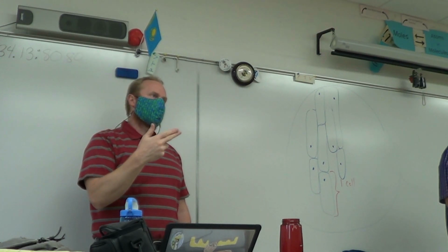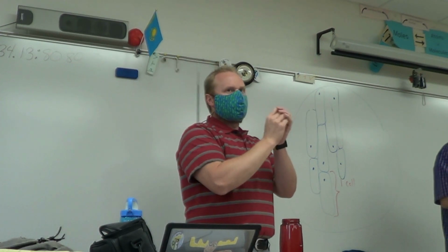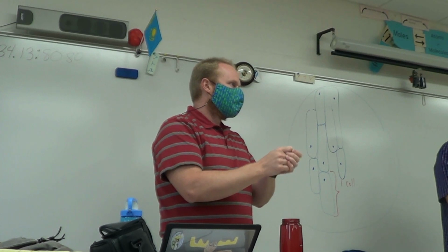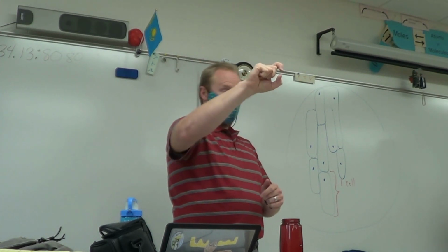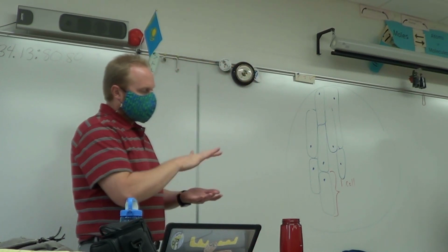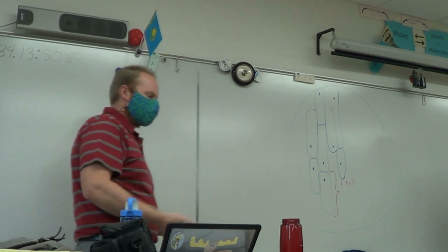But we look at the leaves and we can just cut little slivers, because remember, the biggest we're looking at is 4.5 millimeters. So if you have a little piece of plant leaf that's like that big by that big, that's plenty. You want to make sure you put the purple side up. There's some green on the leaf, but you want to make sure the all purple side is up.